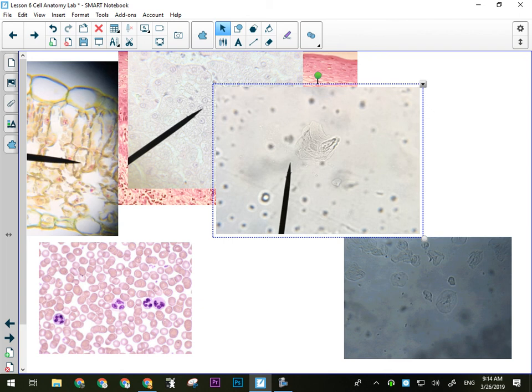All right, so you can see here, it's quite faded, but there's a nucleus. We've got some mitochondria, these three dots here. There's some rough ER here on the edge. This over here is the Golgi apparatus. You have to, I'm not saying use your imagination, but use your imagination a little bit. Again, be reasonable as best you can.